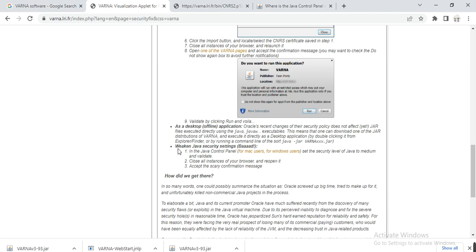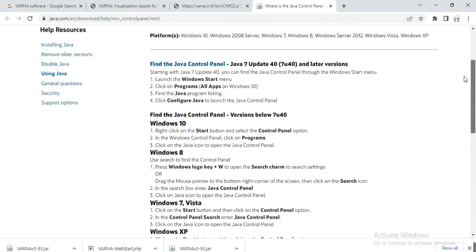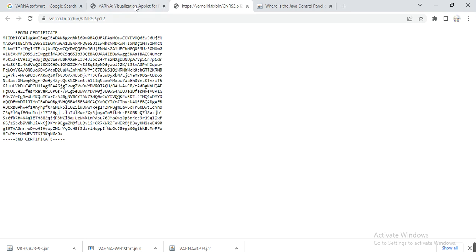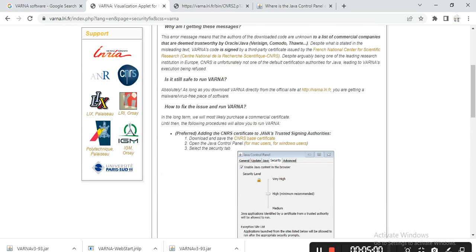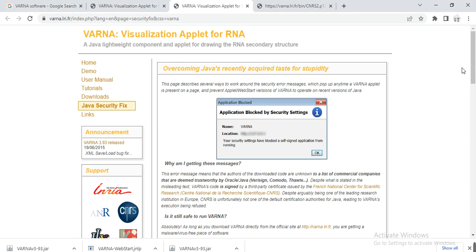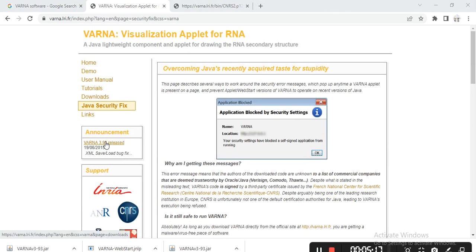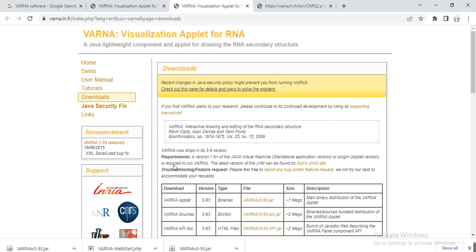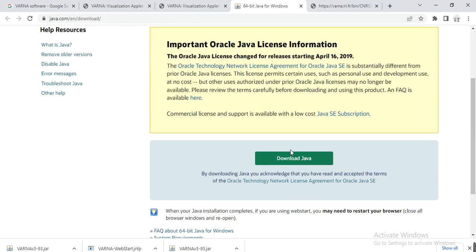For downloading Java, here we can find Java security settings. In the Java control panel for Windows users, this is the way how you can use Java. You can also download and install it. Here you can do the Java security fix. Click on VARNA release 3.93, and here is the Java requirement. This will guide you to the Java download. Here you can download Java and then install it, because this software only runs with the support of Java.